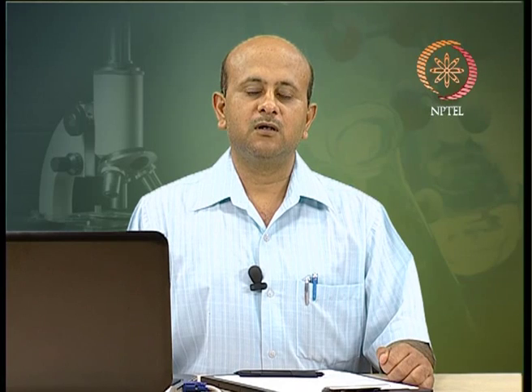When you are spinning these tubes, as we said, accurate balancing needs to be done, so that these tubes are balanced and rotor imbalance is not there.